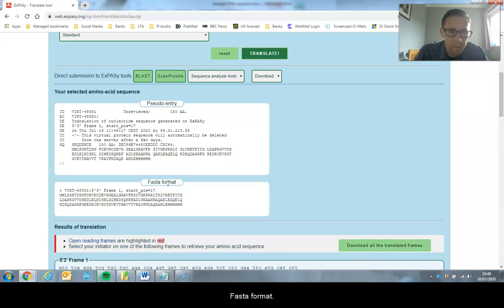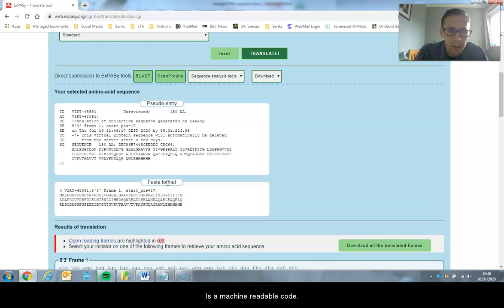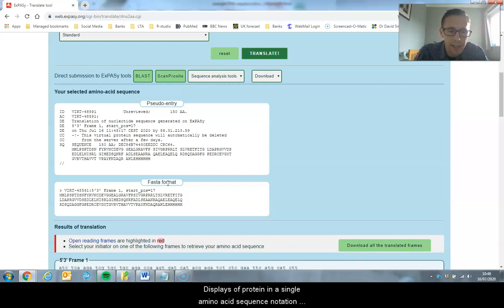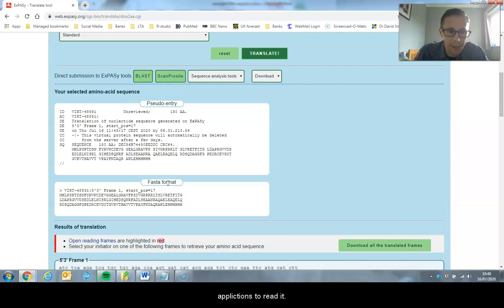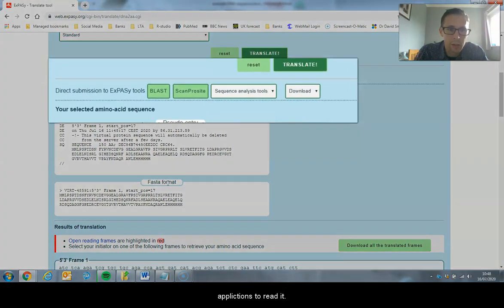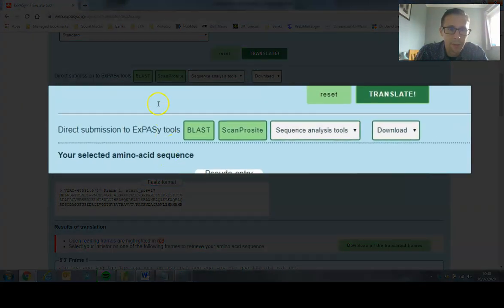FASTA format is a machine-readable code. It displays a protein in its single amino acid notation and allows other web-based applications or bioanalytical applications to read it.